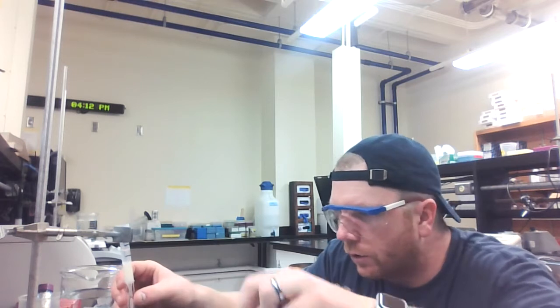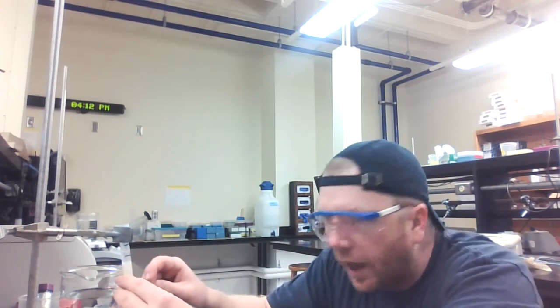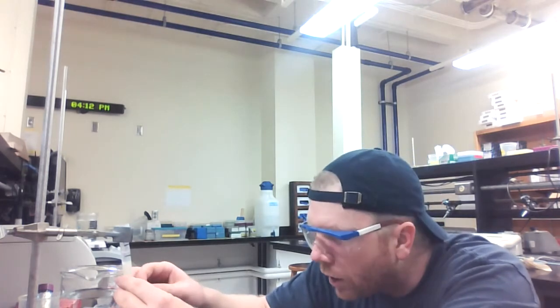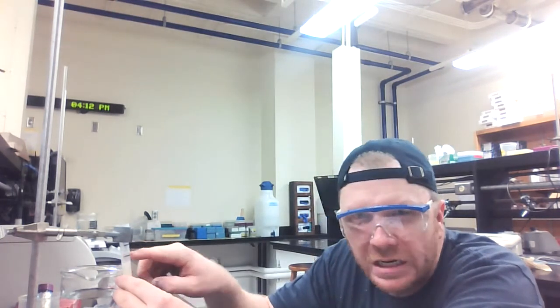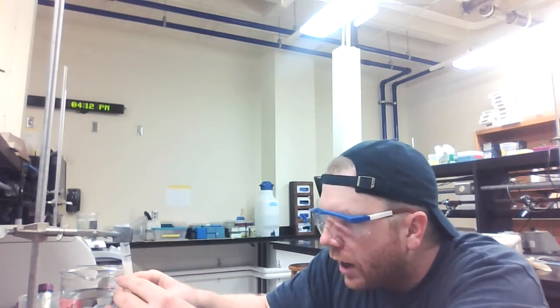Yeah, that's what I'm going to do. I'm going to get basically 2 fractions. I'm going to put the cap on the bottom of my chromatography column once it hits that black line right here that my index finger on my right hand is pointing to. Okay, so now I've collected several fractions that have the proteins that were adhering to the column. So I'm going to go ahead and check the absorbance at A595 of those.